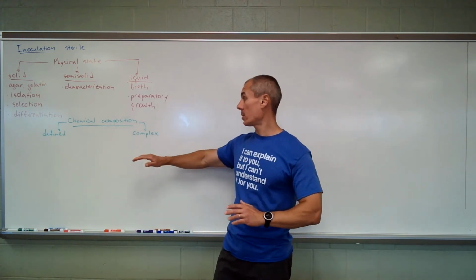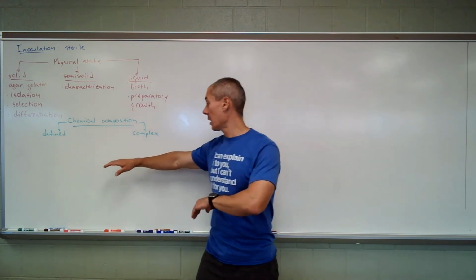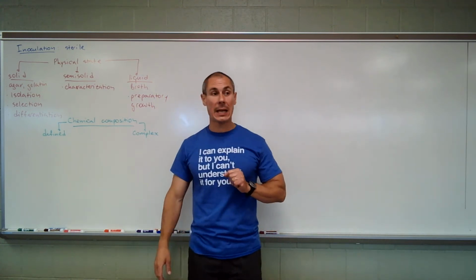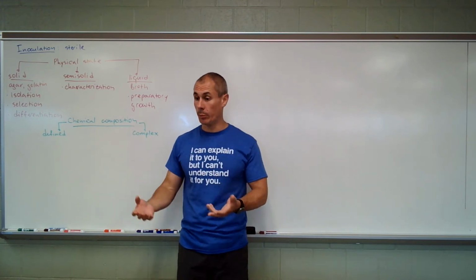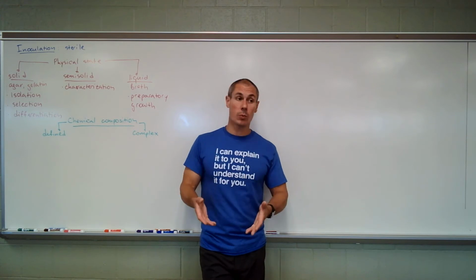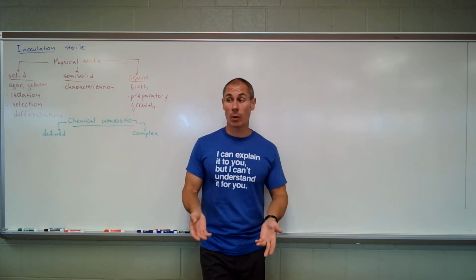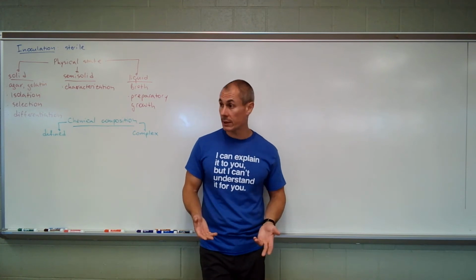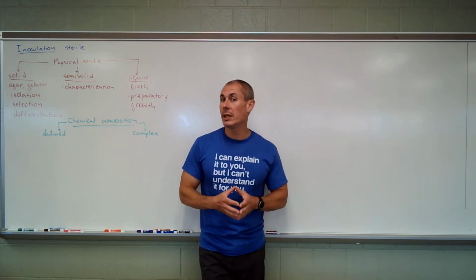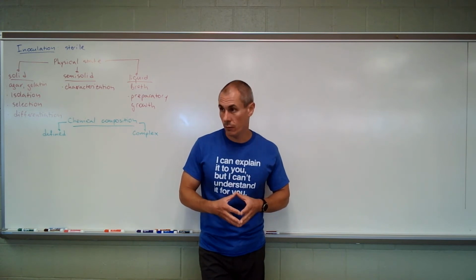So what's the difference between defined medium, which was the description we just gave, and complex medium? Your trypticase soy agar is the complex medium. You take soy protein, treat it with trypsin, break it down in pieces, and throw it in the water with some salt and stuff. Do you know the exact chemical composition of that digestion? No. You see what I'm saying?